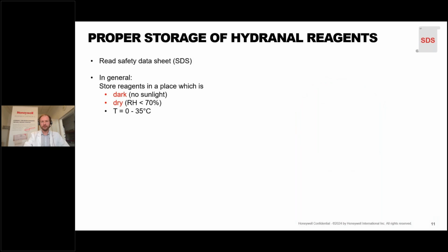One of the most frequently asked questions is how to properly store Hydranal reagents. The easiest way to find first information is, of course, reading the safety data sheet. In most SDS documents, it is written that reagents need to be stored in a place which is dark, dry, and where the temperature is below 35 degrees Celsius.